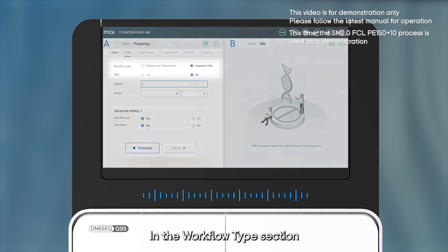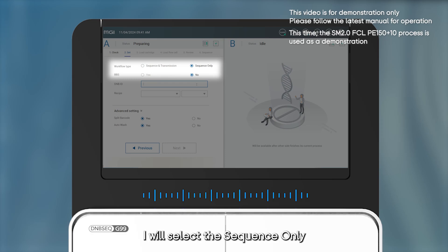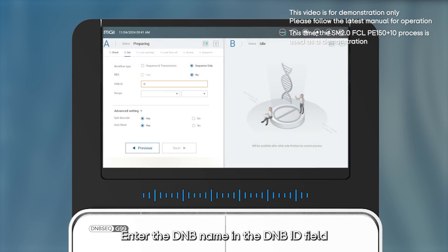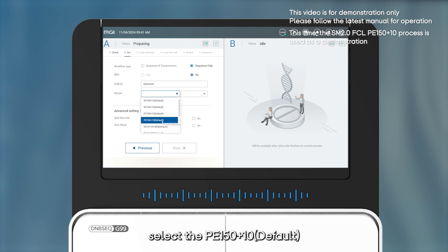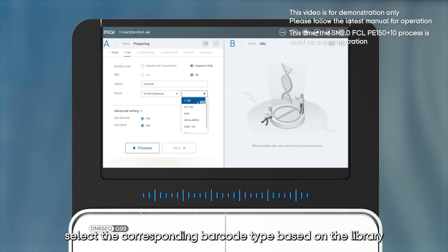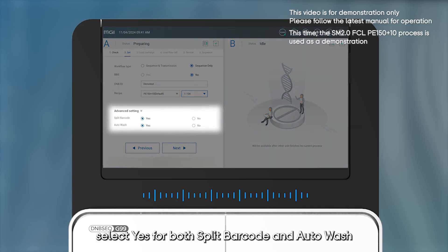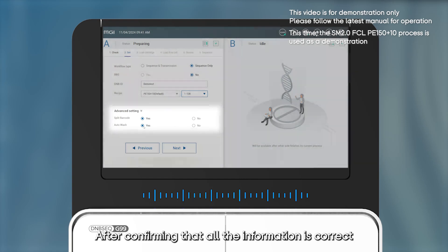The system will sequentially check the status of the disk space, sensors, optical system, and incubation system. The entire self-check process takes approximately one minute. Once complete, click Next to enter the set interface. In the workflow type section, select Sequence Only. The BBS option is set to No by default. Enter the DNB name in the DNB ID field. From the Recipe drop-down menu, select PE150 Plus 10 Default. Then select the corresponding barcode type based on the library information, choosing from 1 to 128.